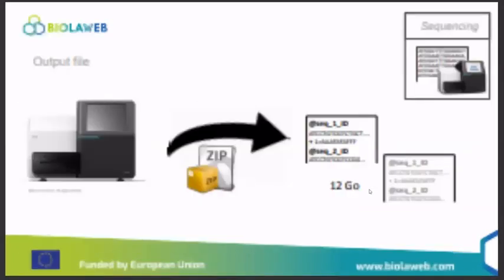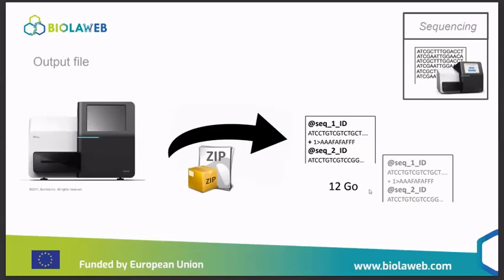And maybe you have questions on the Illumina technology before. Sorry, can you explain the function of index again?